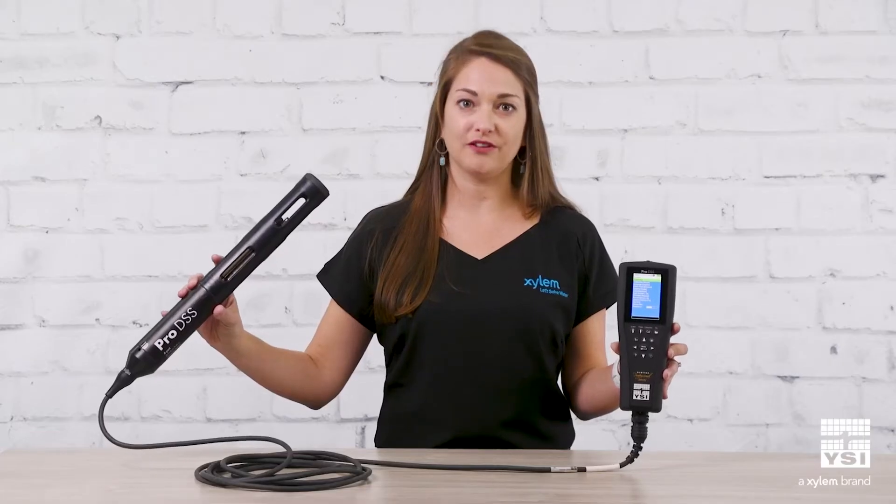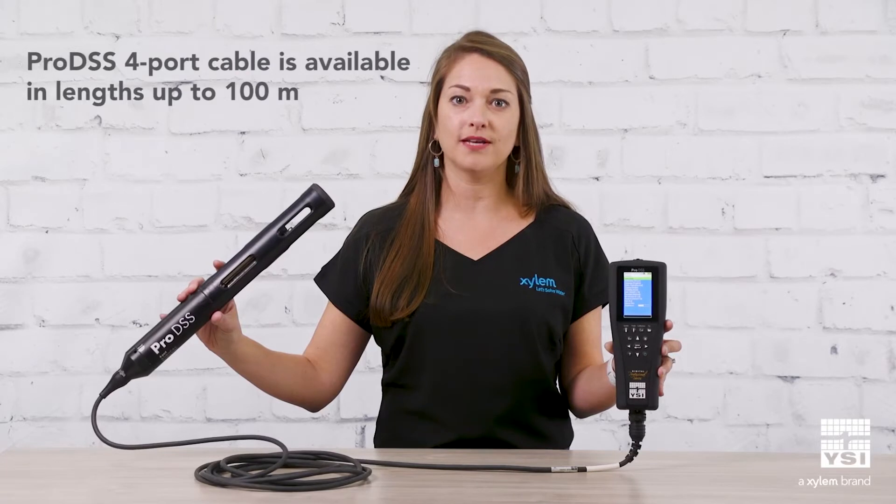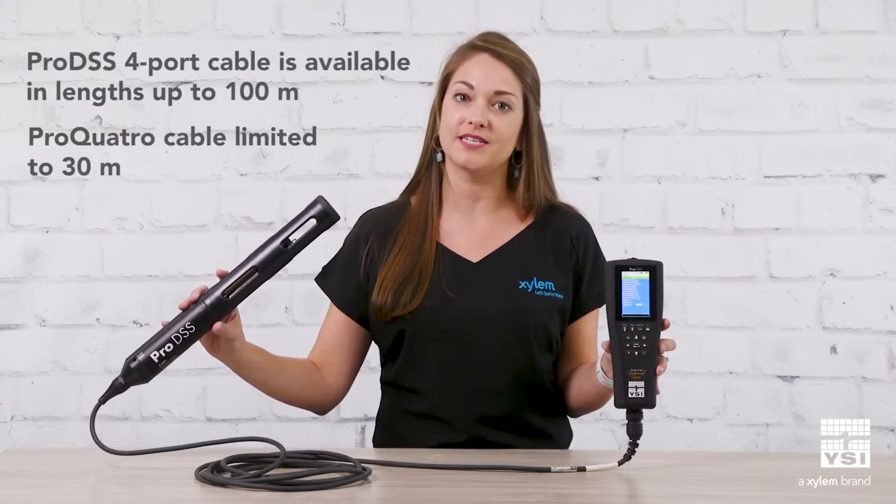An additional benefit for Pro DSS is that the four-port cable is available in lengths of up to 100 meters, while the Pro Quattro is limited to 30 meters.